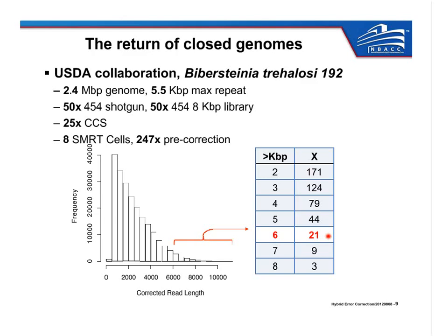So my example there, I believe, was Mira, which performed quite well on the corrected reads, but there really aren't a lot of overlap-based assemblers or De Bruijn assemblers now that can even input long reads. So for example, the 454 assembler Newbler, I think its maximum input size is 2,000 bases. So those constraints affected our choice as well, and Celera Assembler was one of the few that could handle long reads out of the box because it was designed originally for Sanger reads.